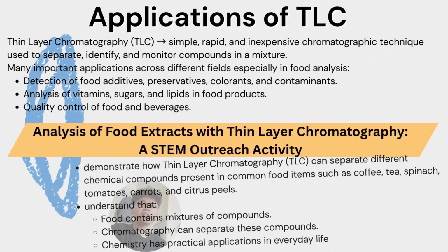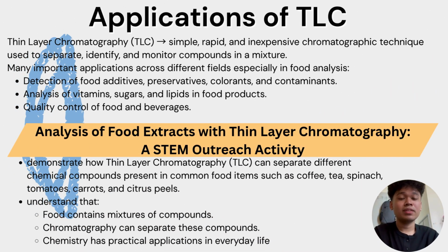Moving on to the application of thin layer chromatography, or TLC. TLC, which stands for thin layer chromatography, is a simple, fast, and low cost method used to separate, identify, and monitor different substances in a mixture. One of its most important uses is in food analysis.